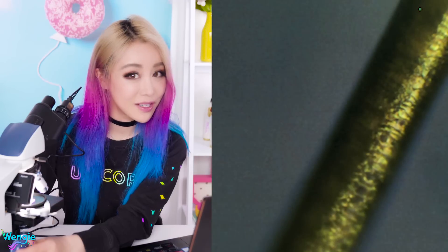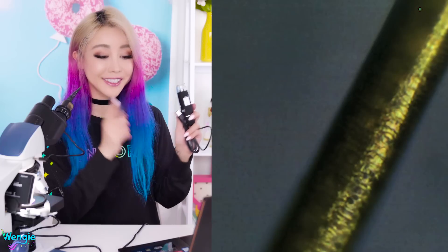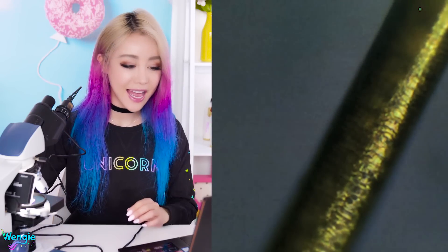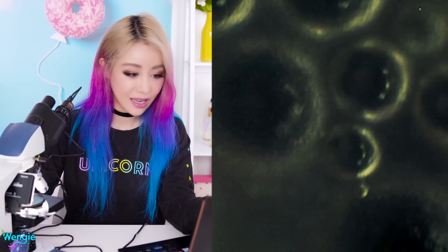Now we're seeing the texture in her hair at 100x zoom. And you know what? That little microscope I bought wasn't even giving me pictures of this quality. So let's see what the slime looks like — back to the slime. That's disgusting! Can you see the texture in that bubble? That is insane.